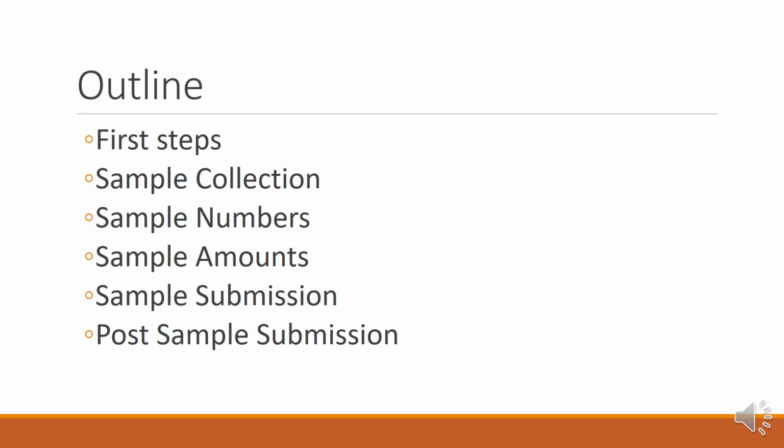This presentation will cover the first steps needed to start a metabolomics project, also cover how to collect samples, the number of biological replicates you will need for good statistics, the amount of biological matrix needed, how to submit samples to the core, and what to expect post-submission.